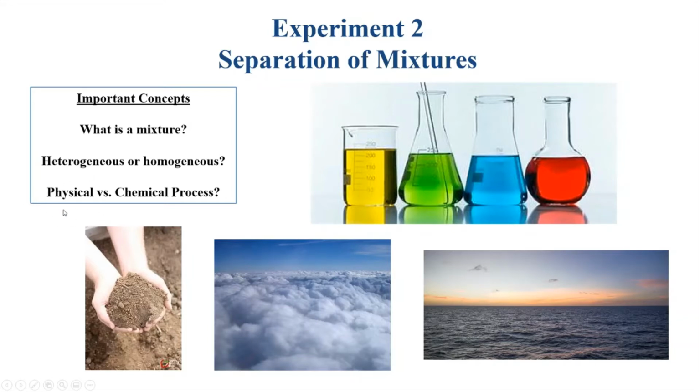The ones that we're going to use are sublimation, which is a phase change where we go from the solid phase to the gas phase. We're going to be using dissolution. So dissolving sodium chloride into water is a physical process because we can evaporate the water and recover the sodium chloride. We'll see that today.